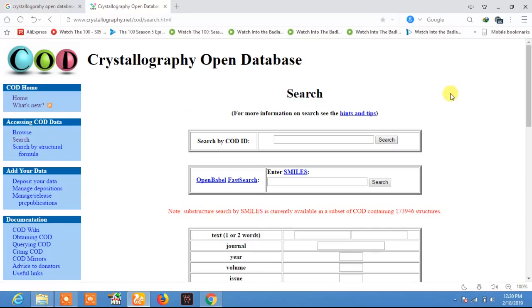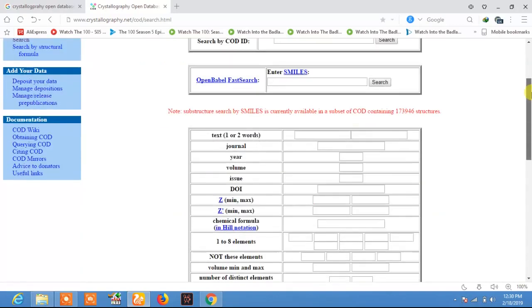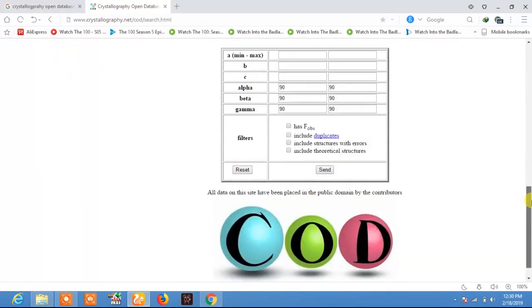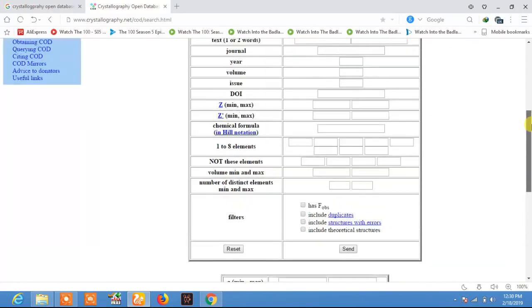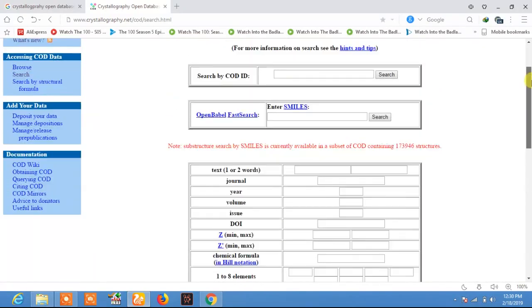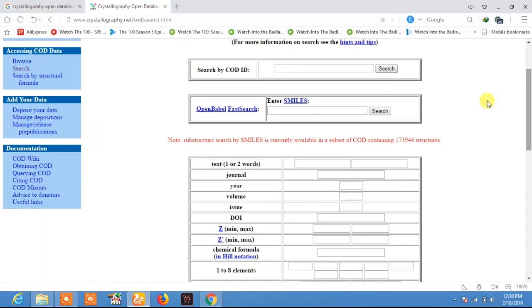On this database, just click on Search. There are definite methods for searching the structure file. The first one is search by COD ID. If you know the ID of your material, you can search that material or the structure of that material very easily by just typing the ID here.